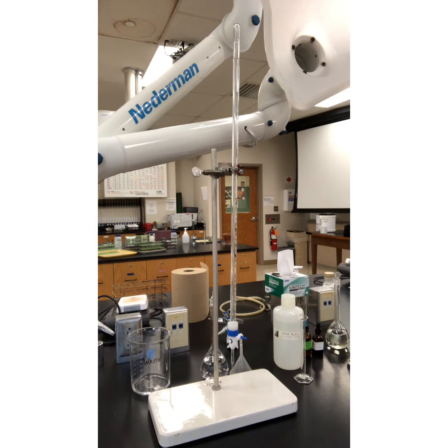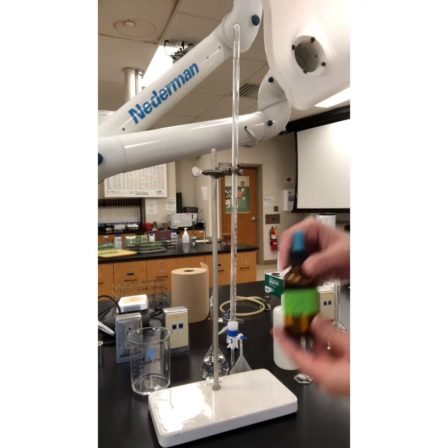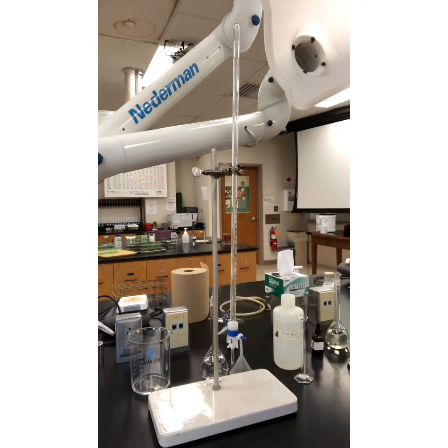Use that again. 3 drops of the freshly prepared potassium ferric cyanide right here. So I'm going to go ahead and add 3 drops of that. 1, 2, 3.